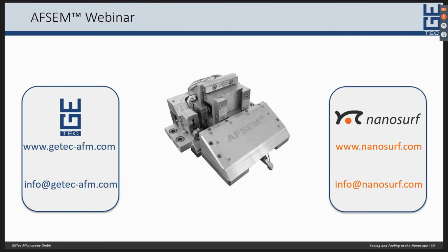This can be different if you decide to use contact mode imaging, for example for these graphene membranes which you have seen in the video. If you try to image these membranes in contact mode, you will most likely destroy them due to lateral forces which act on the membrane. But if you use AC mode, you will have no problem with destroying your sample.